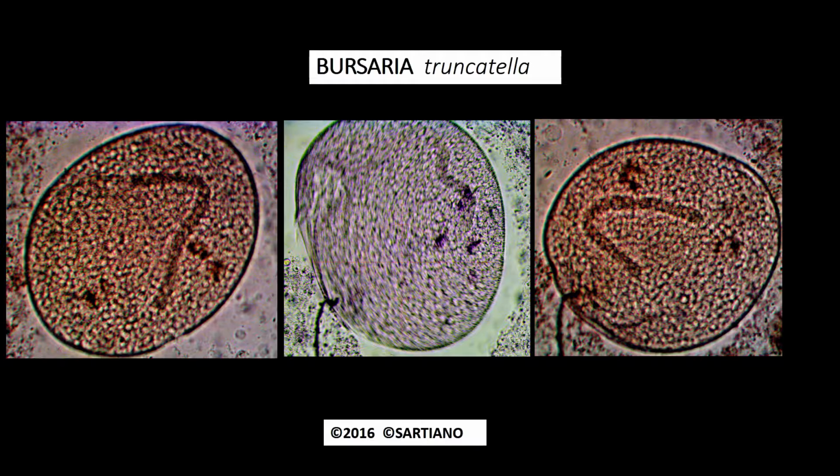In this group of photomicrographs, the nucleus takes on the appearance of the number 7, or a somewhat distorted number 3, or the letter C.